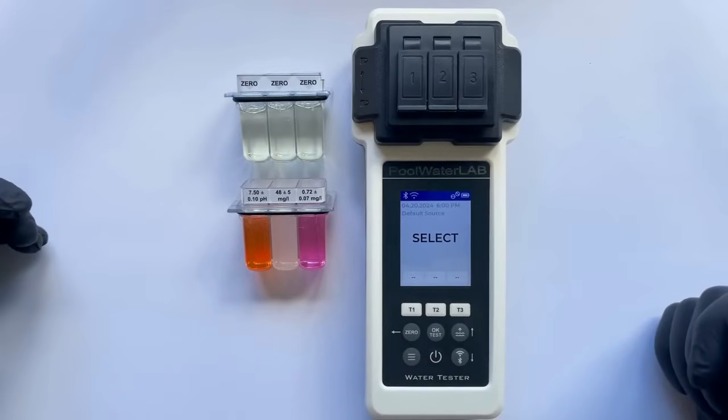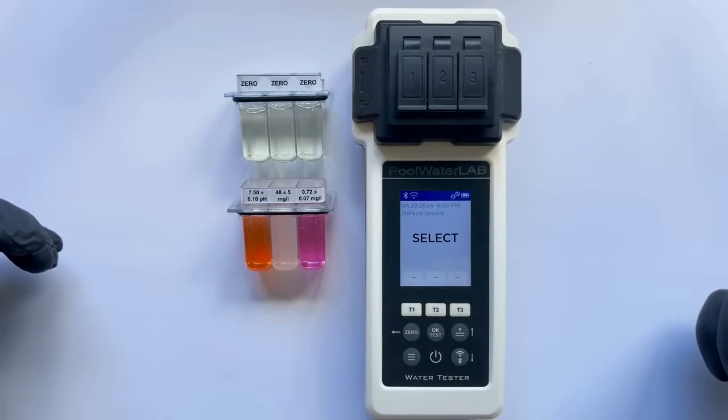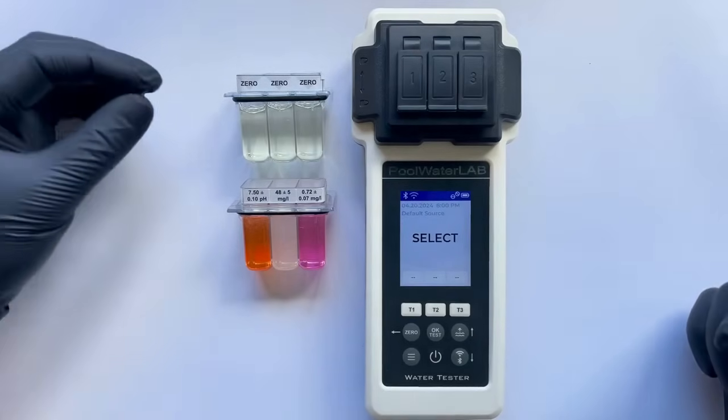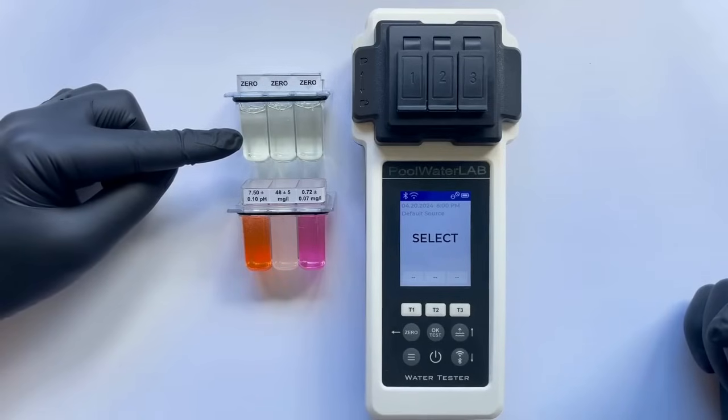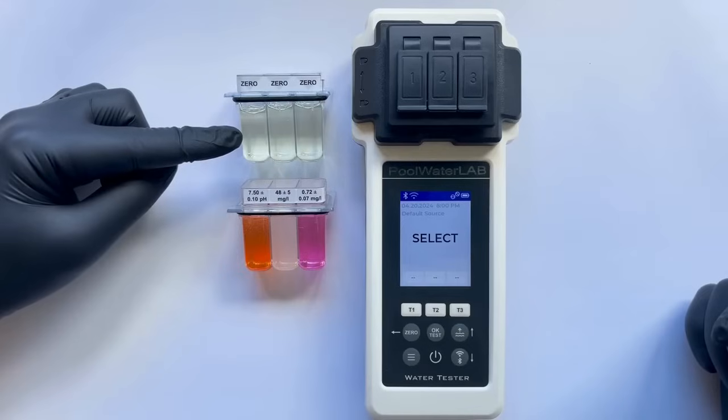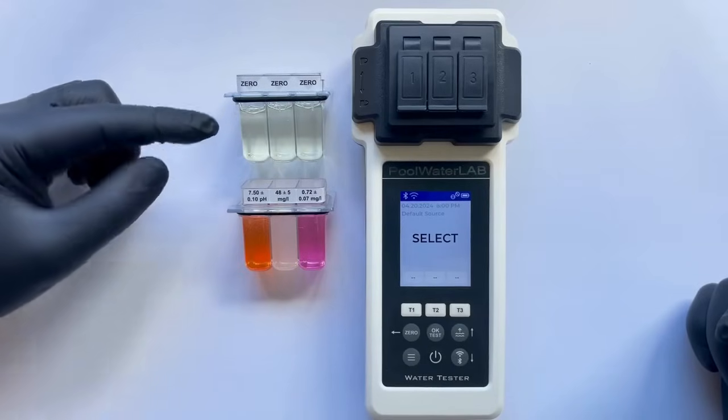To get started, you'll need to order laboratory water samples, also known as water tests, to ensure accurate and reliable testing. You should receive both pure water for a zero test, which serves as a control to establish a baseline for no contamination or chemical interaction, and the same water mixed with reagents.